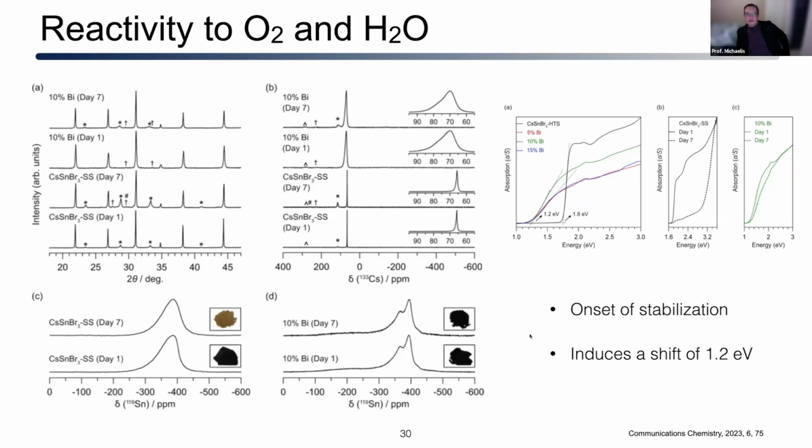We don't actually show that, but if you acquire it over here, you see that. So this composition decomposes through oxidation, and that's what gives rise to the color change. But you still have some residual tin bromide here. I think if I remember correctly, this 6 phase is yellow and this one's black, and so combining together makes this dark brownish gold color.